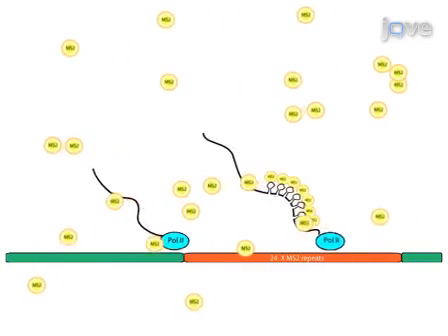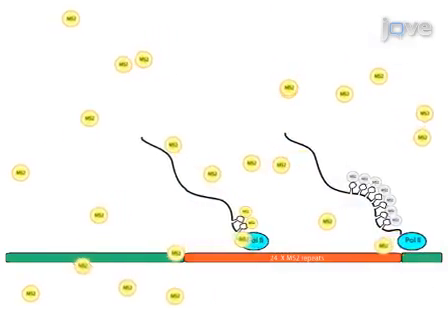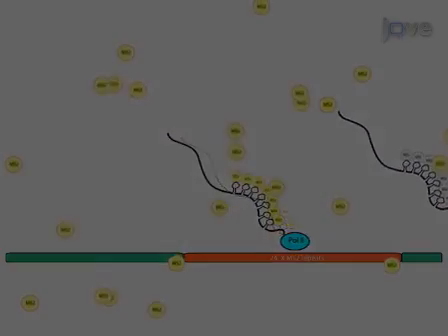The results obtained show that RNA polymerase II elongation rates in vivo can be measured, and that these are much faster than previous in vitro measurements.